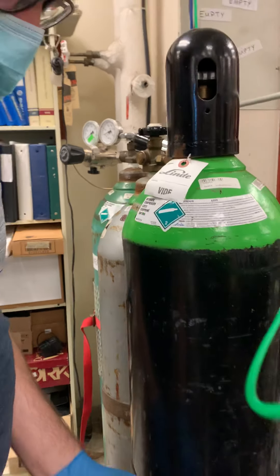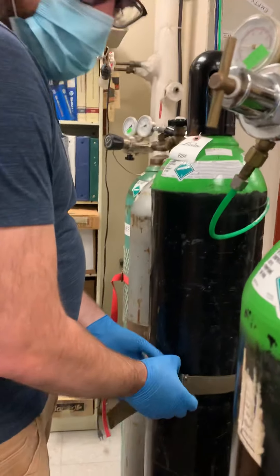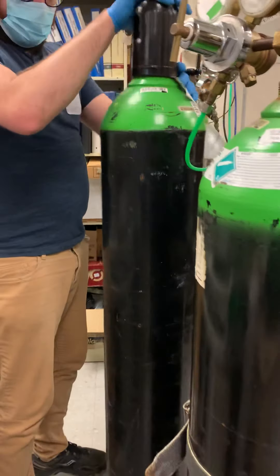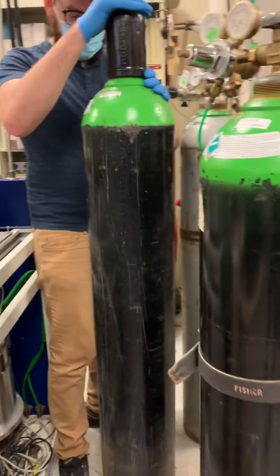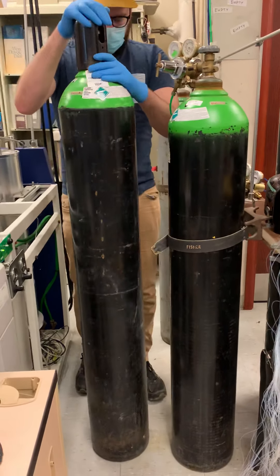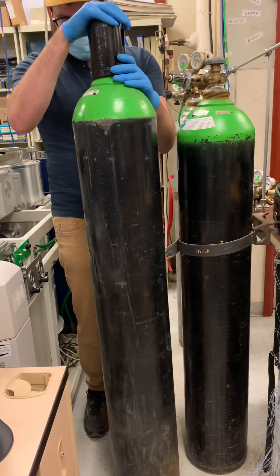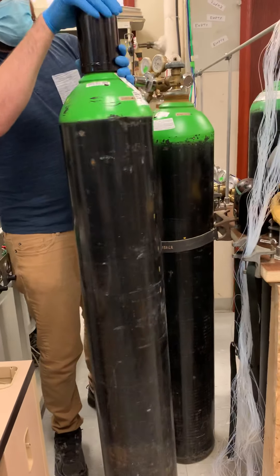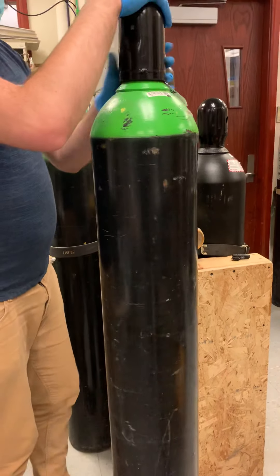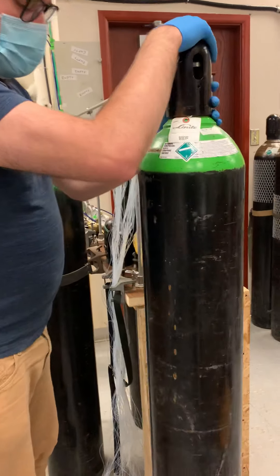This is where the skill comes in — moving the cylinder from where it is. It's kind of like a rolling motion. Sean is rolling it out of the way very slowly. It's still pretty heavy even when it's empty, and you don't want to be dropping it. He's going to roll this one out of the way and replace it with a full one.